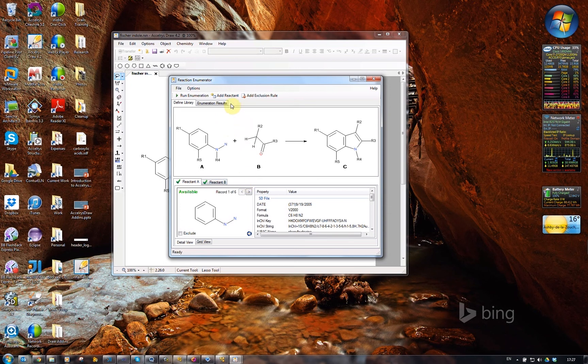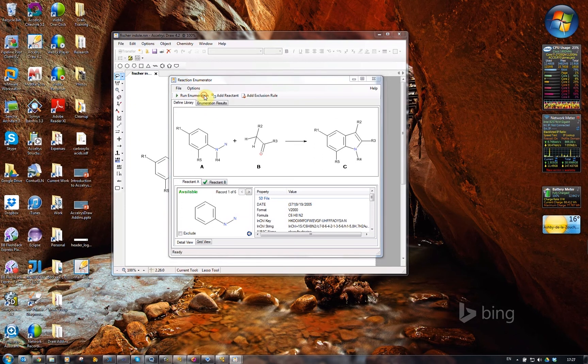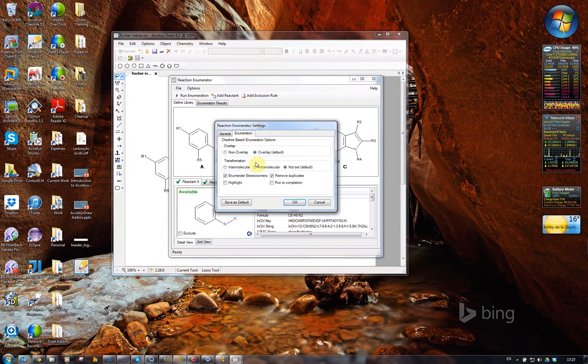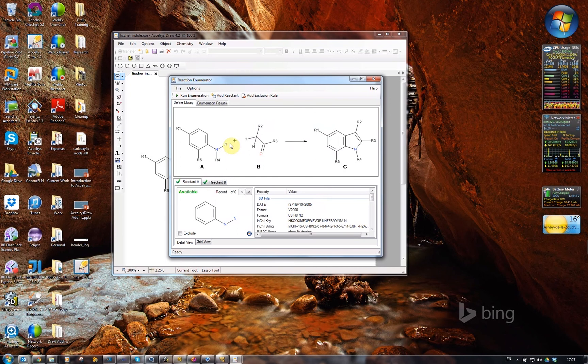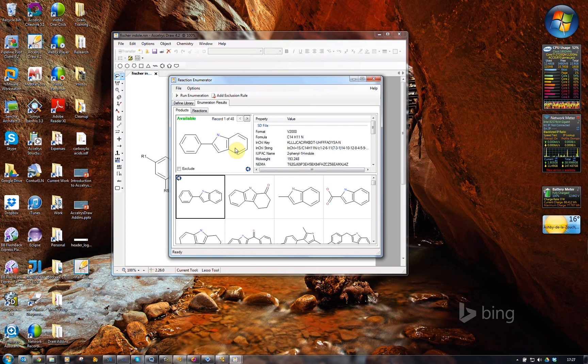I could, if I wanted to, add some extra reactions at this point. I could define some exclusion rules. I'm not going to. There's also an options menu where I can have some settings and enumeration options. I'll leave those at the defaults for now. If I click on run enumeration, it very rapidly enumerates those reactions.